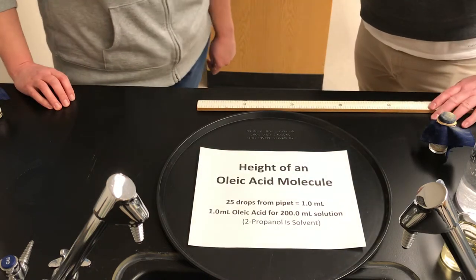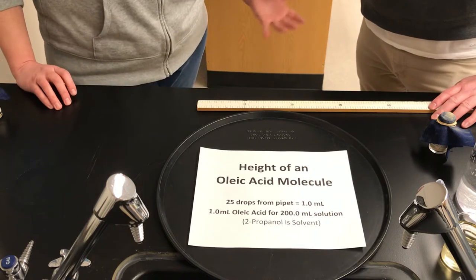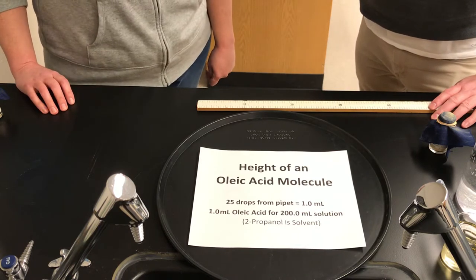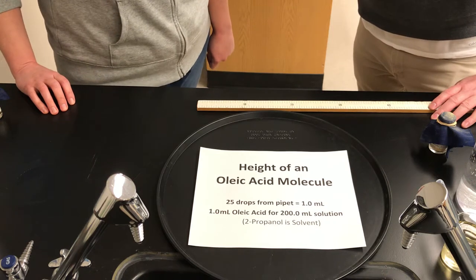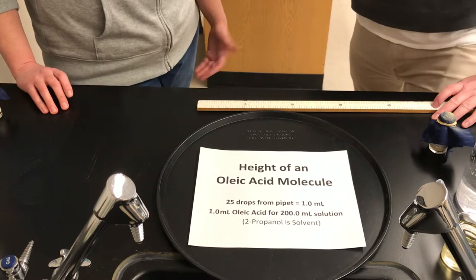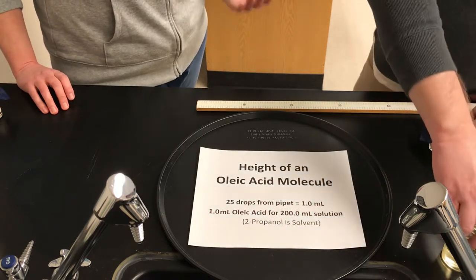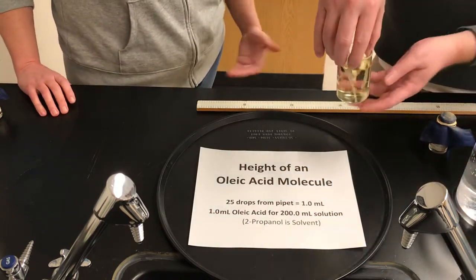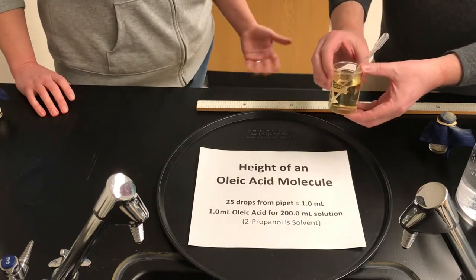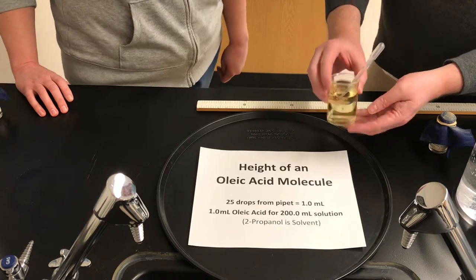So the molecule that we're going to be looking at or working with today is called oleic acid. Oleic acid is a type of fatty acid. In particular, the solution that we're going to be using is made up of one part oleic acid for every 200 parts of alcohol. The alcohol that we're using as a solvent here is 2-propanol.